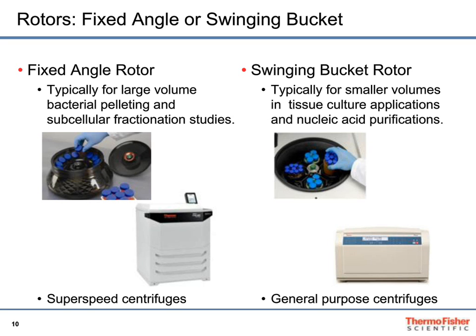Having said that, it's amazing, there's always exceptions. A little microfuge is actually a fixed angle rotor. That's the way those applications have been driven. So, here's a combination. Most of the floor model centrifuges that I get involved with actually do have both. They have fixed angle and swinging bucket, depending on the application. Usually swinging bucket applications are for gradient work and that type of thing. And so if people are getting into those type of things, we try to talk to them about how to manage their acquisition so they get what they need both in fixed or swinging bucket.